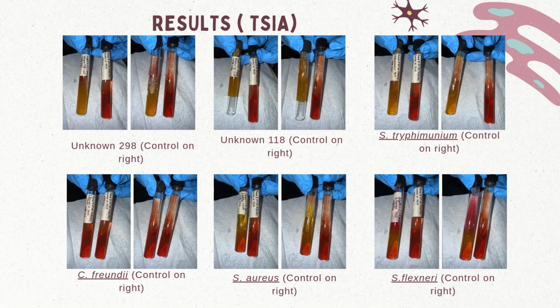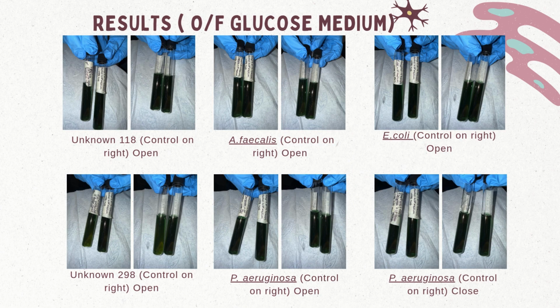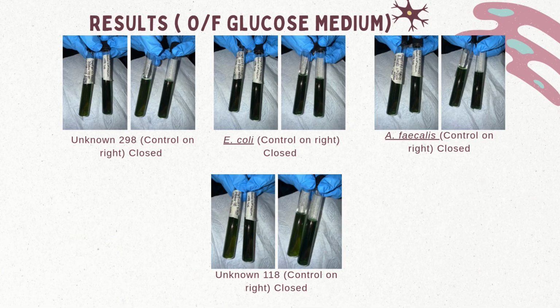The TSIA, and it continues. And you can see how we got a control for each one. We can see the different colors and how they looked different from the control.